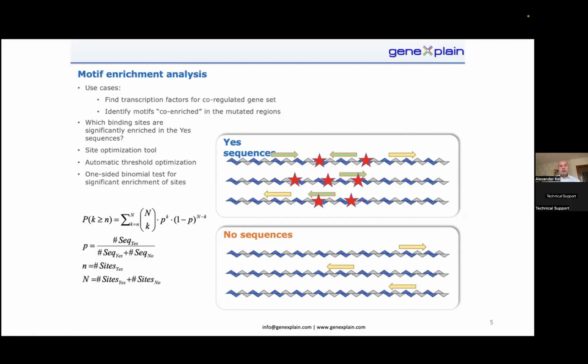So they need cooperation. There might be several mutations in that region where the site is intact, but they destroy other sites, or the distances between sites, or the possibility of DNA looping. So basically they destroy a possibility for those factors to cooperate, or maybe create such a possibility.